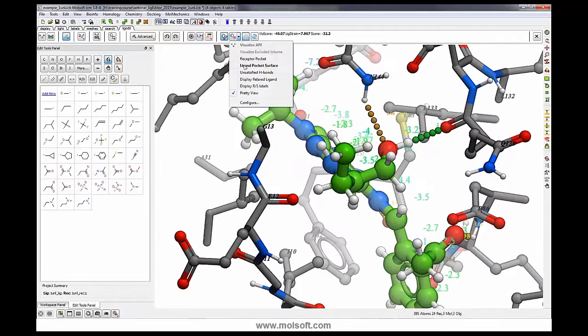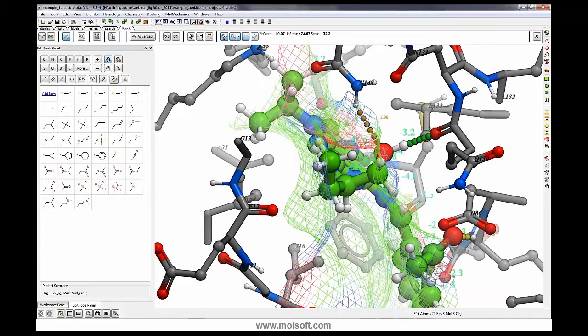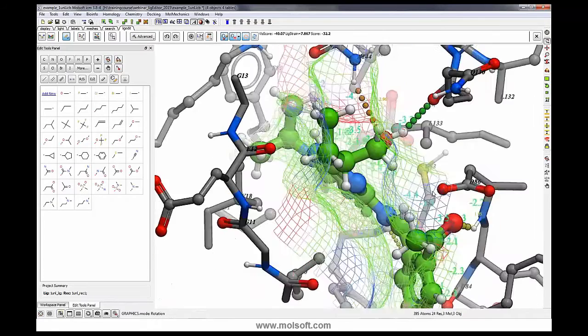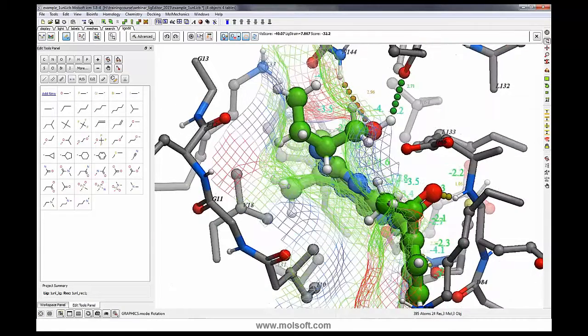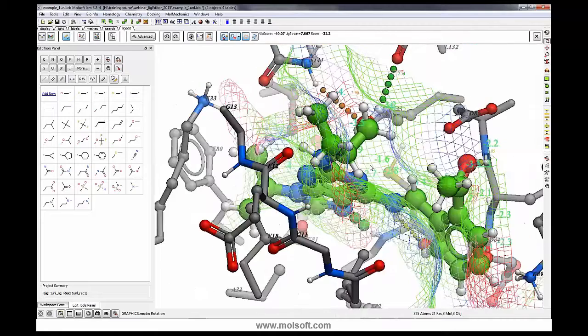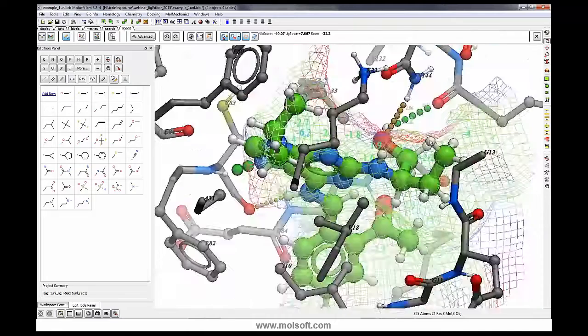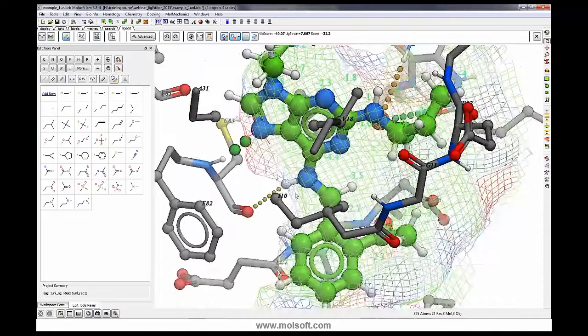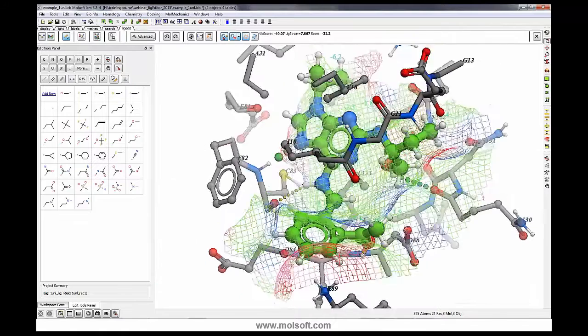So let's go back to the ligand pocket surface again. As I mentioned earlier, there are two positions where we can modify. So using my orientation, the hinge is here. There was this region here at the bottom, and there's also a gap here.